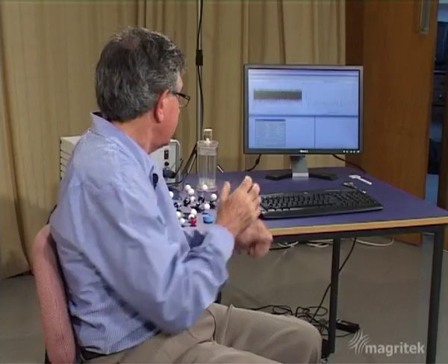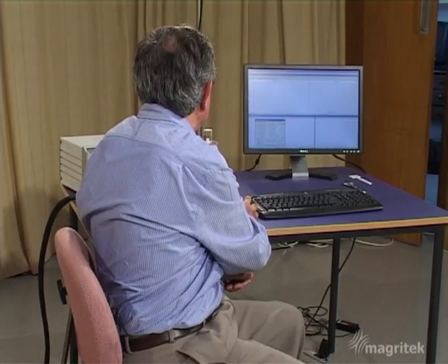So, now we're ready to carry out our very first nuclear magnetic resonance experiment on the Terranova apparatus. Remember, we're going to start with that prepolarizing pulse to produce some larger magnetization, and then we have to disturb the spins from their thermal equilibrium state. And for that, we use the transverse oscillating magnetic field, which is inside this probe. And we apply that for a short period as a pulse. Just waiting now while the prepolarizing is going on.